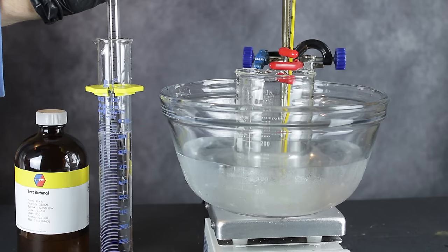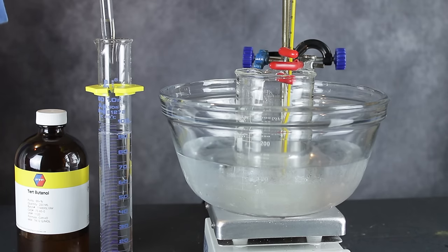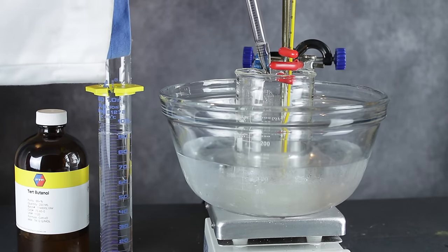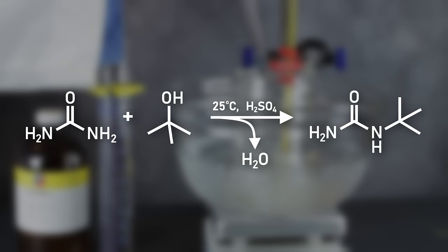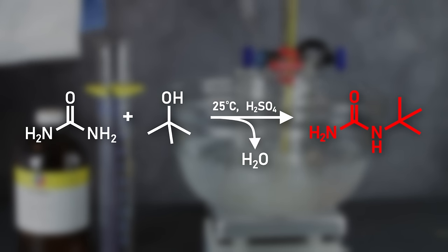After all the urea was in solution, I let the temperature settle to below 10 degrees before slowly dripping in 94 milliliters of tert-butanol. In this part of the reaction, a compound known as tert-butyl urea is formed, which is what will be converted into tert-butylamine later on.